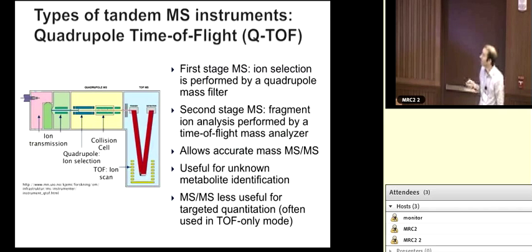So in summary, metabolomics, like other omics sciences, is based on instrumentation. NMR and mass spec are complementary. Steffi will tell you more about this. And we've got the instruments we need, and I'm happy to answer any questions. And now we can close the black box if you guys are done.